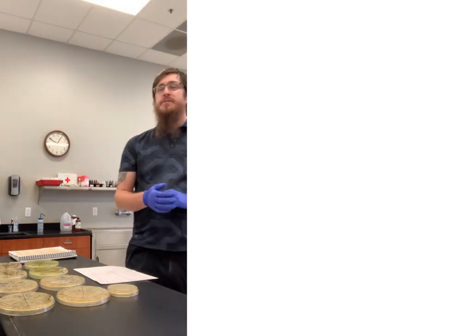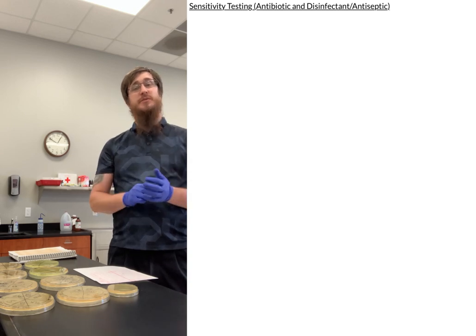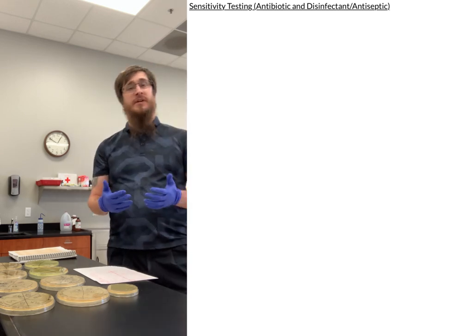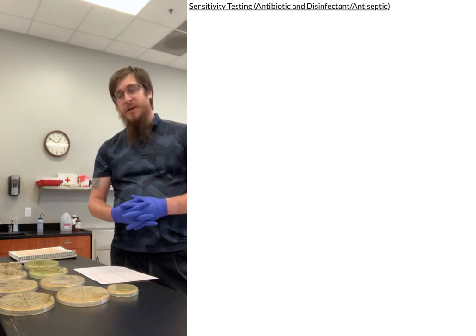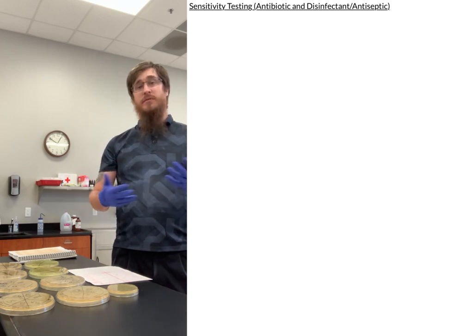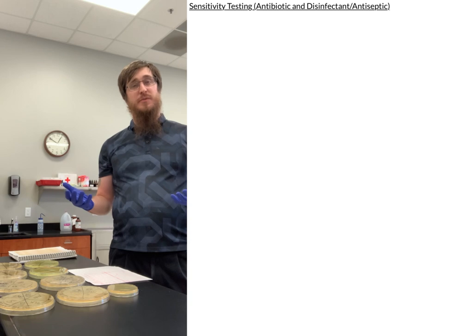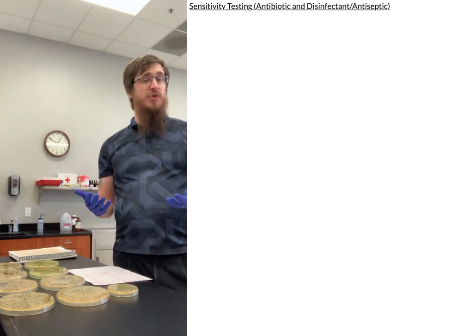Hey everybody! For today, we're going to be talking about sensitivity testing, and specifically sensitivity testing using antibiotics and disinfectants and antiseptics. And we're really just going to talk about both of those together because normally whenever we run these labs, the techniques are basically the same and we use the same materials mostly. So it's just easier to make one video about it rather than making two.